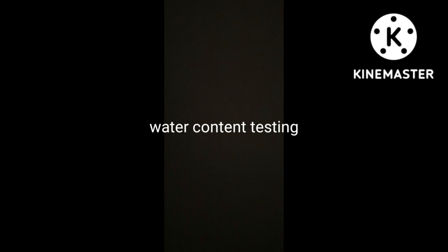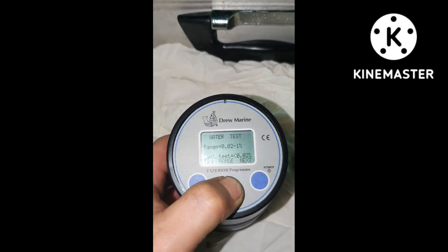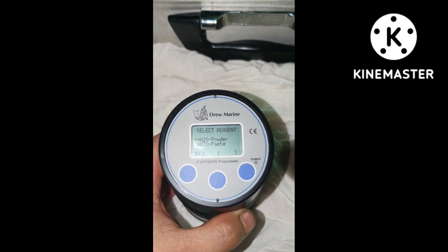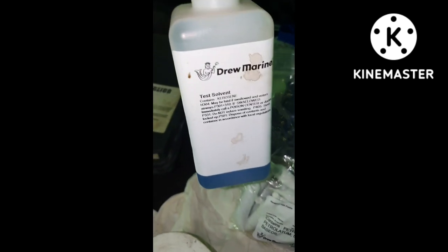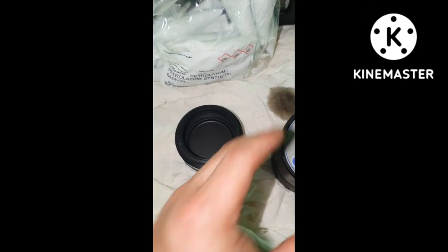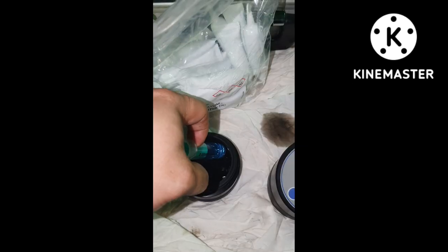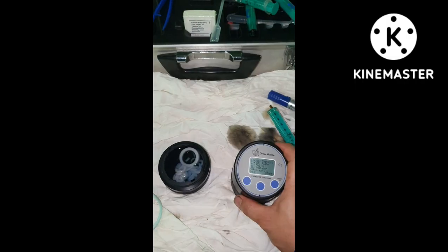Next is the water content testing. We use the DrewMarine device to measure water content in our oil. Choose the range from 0.02 to 1%. Press next, then press 2 for H2O paste. You can see the procedures and requirements for the testing. Pour test solvent into the beaker — 10 ml of test solvent poured to the lid, then another 10 ml. Put the H2O paste, then 5 ml of oil sample. Put the agitator and place the lid.